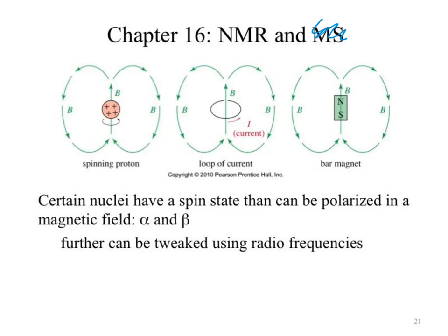Okay, so the HNMR tends to be used much more commonly and is quicker and easier as an analytical tool. Carbon NMR is a little bit less so just because its magnetic isotope is not in high abundance. Okay, there are other isotopes that have magnetic moments, or other elements, we aren't concerned about those because they're not organic, okay? Or at least not organic enough for us to jump in here.